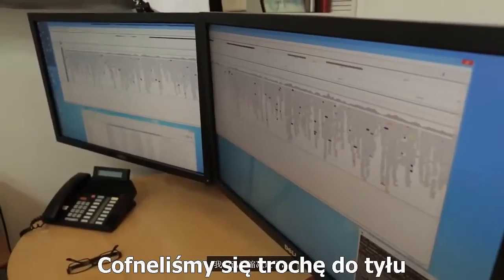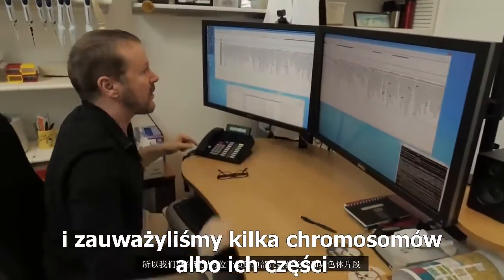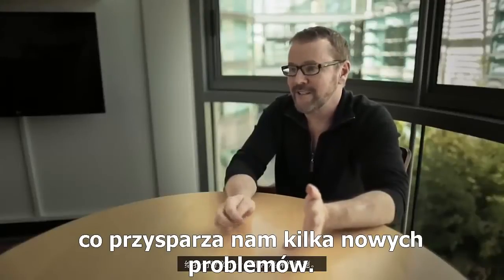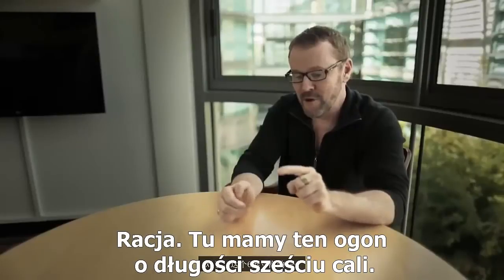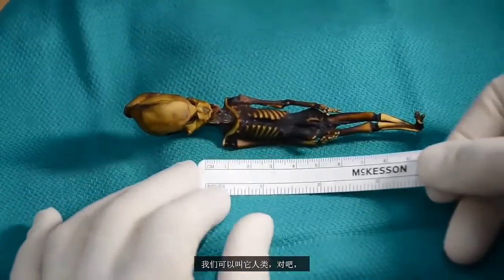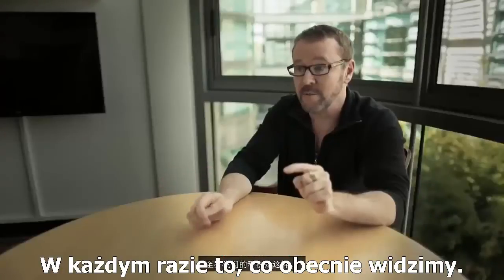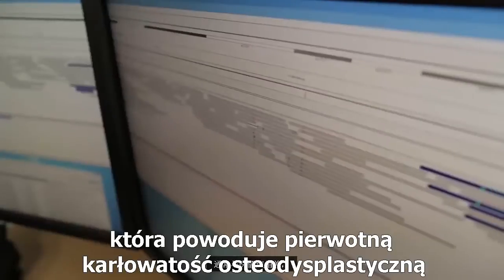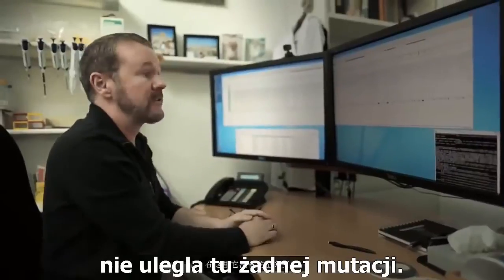What we've done is we've scaled back and we're seeing several chromosomes and pieces of chromosomes across the top, which leaves us with a very strange conundrum, right? Here you've got this 6-inch tall, let's call it human, because the DNA says so far it's human, at least the way that we're looking at it. This gene, PCNT, which is known to be associated with primordial dwarfism, we don't have any mutations here.